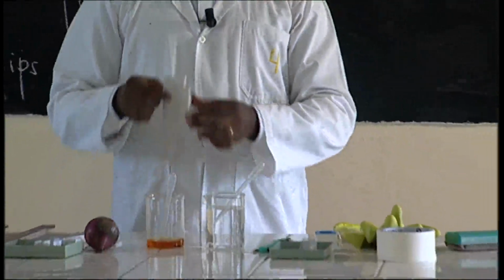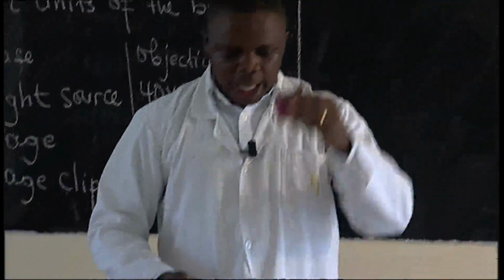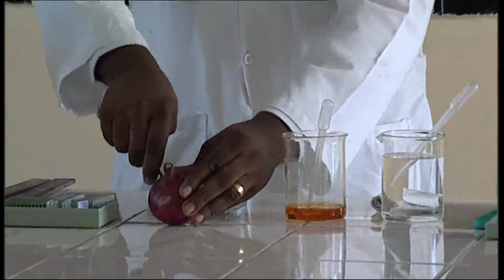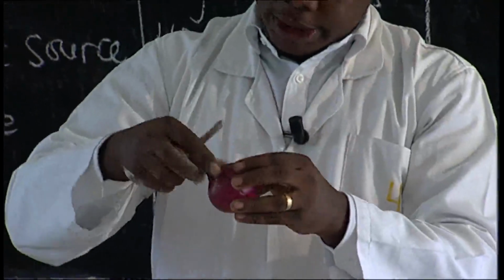Now, I also have a tissue. Then what I do, I cut my specimen. First, remove the outer part.